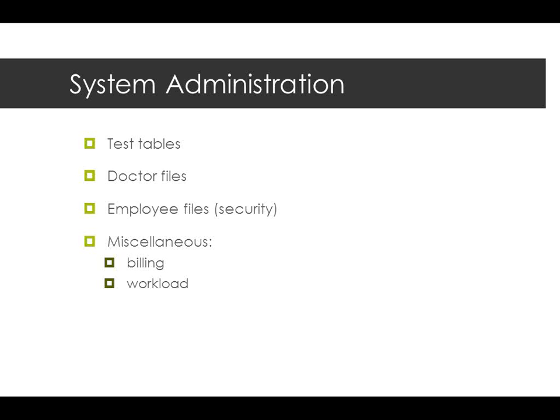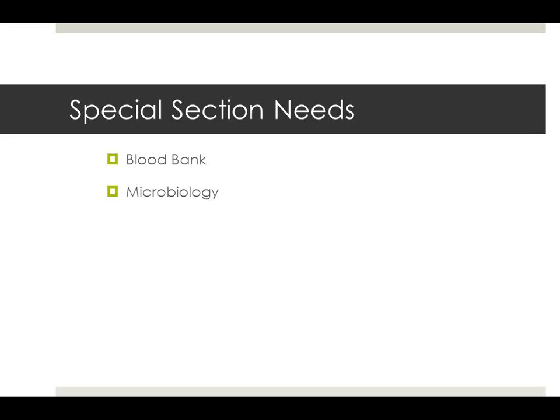System administration, we've got to maintain the system, so updating test tables, updating doctor files, updating our employee files, particularly with security and bringing in new people, and when people leave, make sure they're out of the system and can't get back in. And then things like creating billing files, workload reports, so that for each test I have a workload minutes, so I can keep track of how much workload I've got, which makes me justify to the medical center how many staff I have, those kind of things.